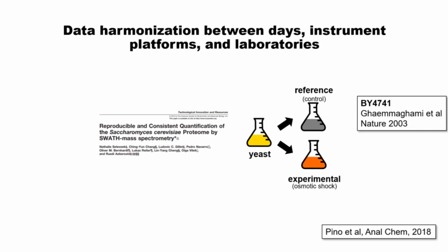No, so if you didn't have a value, it'd be a percentage relative to 1. So when I mentioned PDB, like PD belemnite, we used to call it per mil, so parts per thousand, because our precision was so good, everything was in parts per thousand. But in the case of here, we'd probably just report it as a percent relative to our reference. In fact, we even mentioned this in the paper, saying if you didn't actually have a number associated with it, you just report everything as a percent relative to the reference.